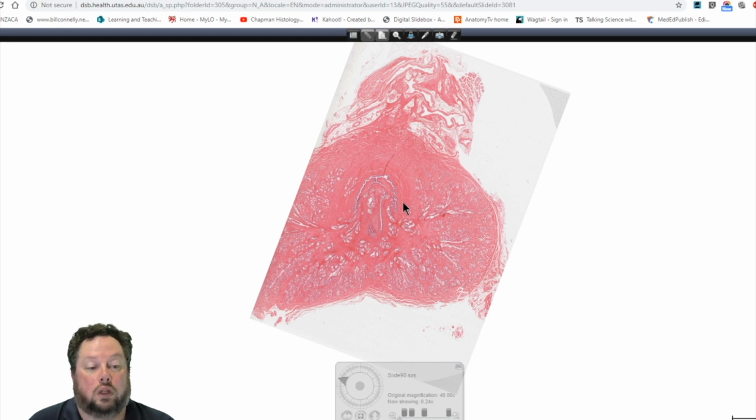As I look at my slides, you can be looking at your own slides. That's our dream anyway. So hopefully we can get there.